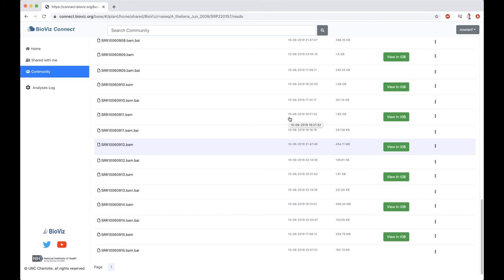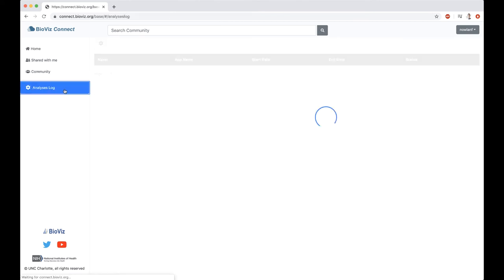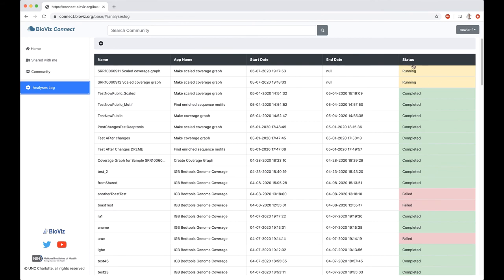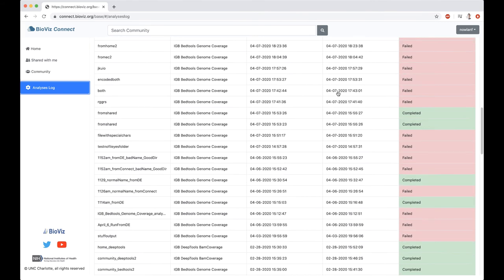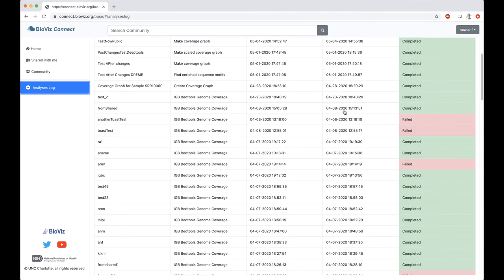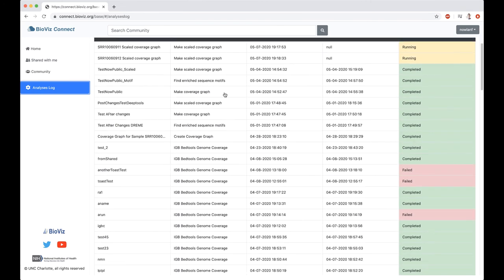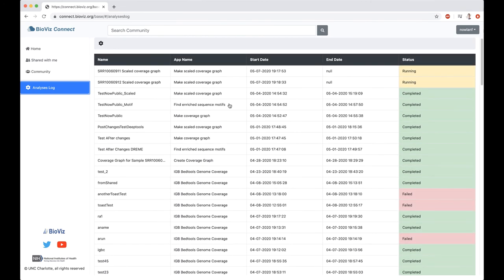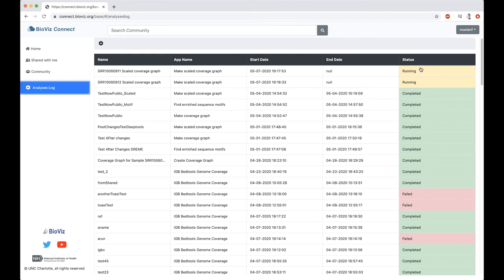If we want to know what the status of our analysis is, we can go over to the left panel. This is our final link that we had looked at before, which is the analyses log. If we click on that, we'll see a list of all of the analyses we have run, when they were run, their names, and their status. I've got a lot of various tests that we've been running. You can see the name that we gave our analysis, the app that we use, Make Scaled Coverage Graph, when we started, we haven't ended yet, and then the status, which is currently running. Statuses can be submitted, running, failed, or completed.